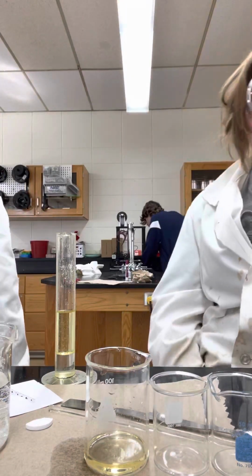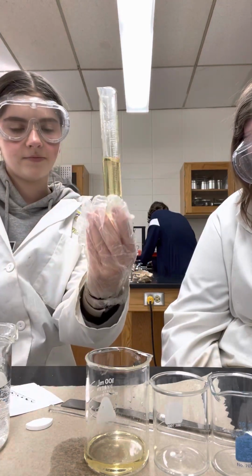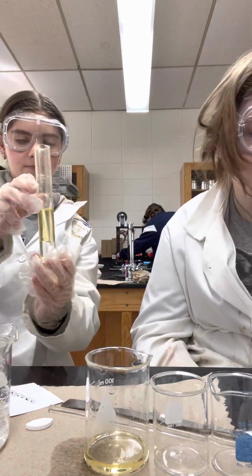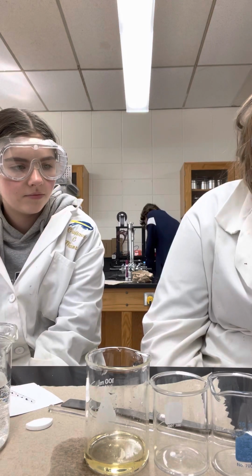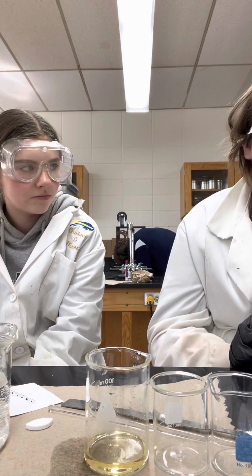Observe. What did you observe? The oil did not drop down to the bottom of the graduated cylinder. Instead, it rose above the water. It did not mix. The water is heavier than the oil. Conclude. Based on your observation, is this oil polar or nonpolar, and why? Or can it not be concluded from the experiment? Include whether this agrees with your hypothesis.